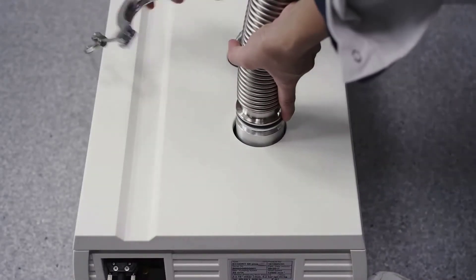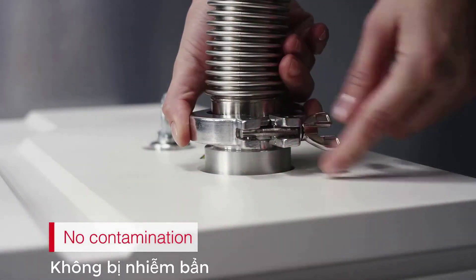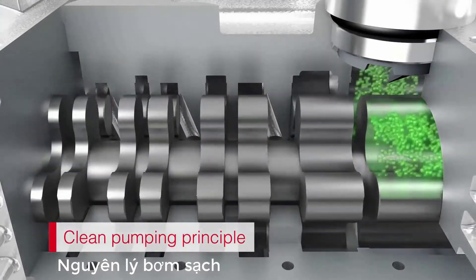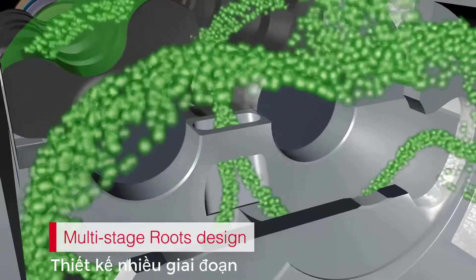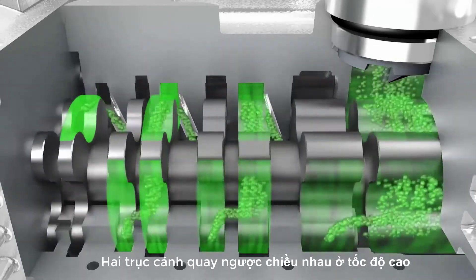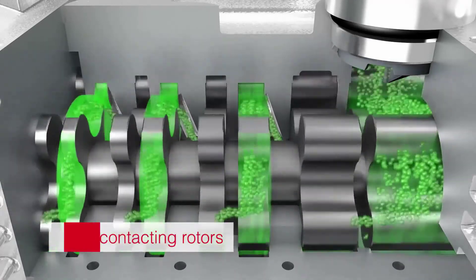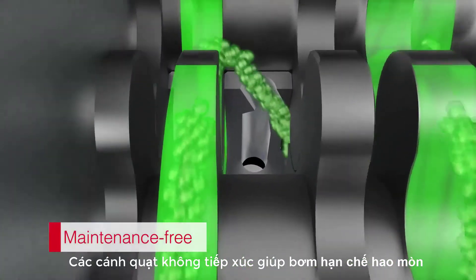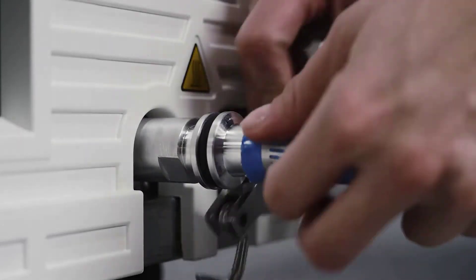When you connect the Eco Dry Plus to your vacuum chamber, you can rest assured no oil or dust will contaminate it, because this dry pump needs no oil and produces no dust. Thanks to our clean pumping principle, it's based on a multi-stage roots design: two rotors turn in opposite directions at high speeds, compressing the gas as it moves through several chambers until it is discharged. Most importantly, the rotors do not touch each other or the housing, keeping your pump wear and maintenance free, and your vacuum chamber clean.